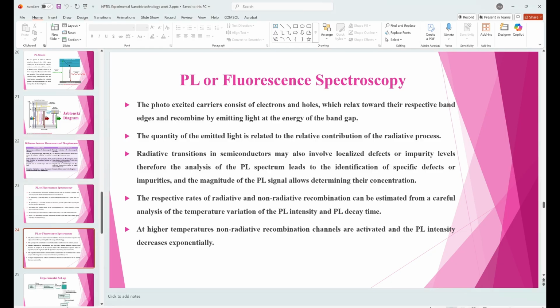So in UV visible, you use a two-walled quartz cuvette. Why is quartz used? What kind of material? I think it is also already mentioned in the course. In UV visible, you use a two-walled quartz cuvette as the detector is at 180 degree. Why is the detector at 180 degree? Because transmitted light is always at 180 degree. That is why the detector is at 180 degree.